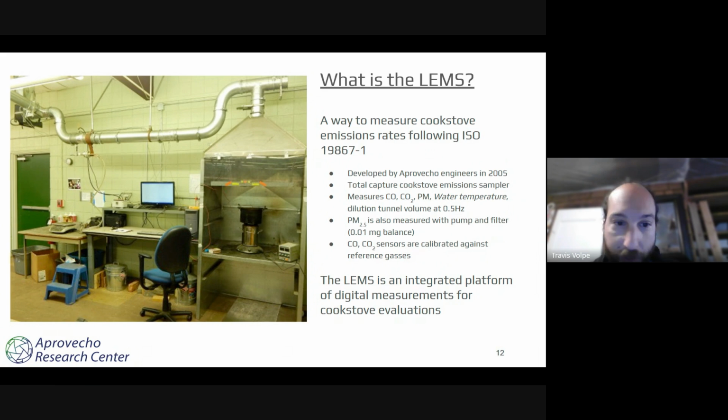We measure carbon dioxide, carbon monoxide, particulate matter, the water temperature, as well as several other metrics inside of our dilution tunnel at 0.5 hertz. So every 2 seconds, the sensors are taking recordings and sending them back and logging them to the computer.